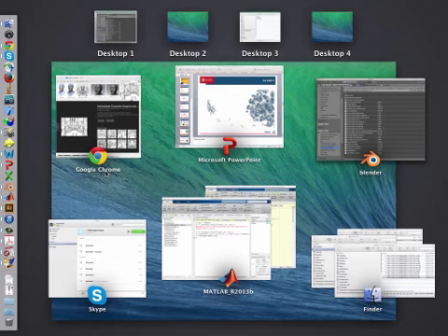Yes, you can go into the script and change the radius. Andrew just asked what the thing is with the radius of the alpha hull. You can change the radius, but if you look at an atom probe data set, the radius is pretty much always the same. It doesn't change much, right? If you look at the concavity at the bottom of an atom probe data set, it doesn't have a radius of 0.2 nanometers, and it's not going to have a radius of a couple of microns, right? So 5 nanometers is a pretty good value. If for some reason your hull looked completely weird, you'd go and change that.